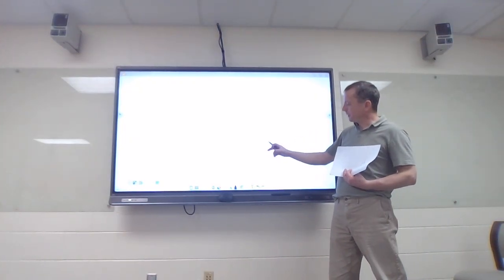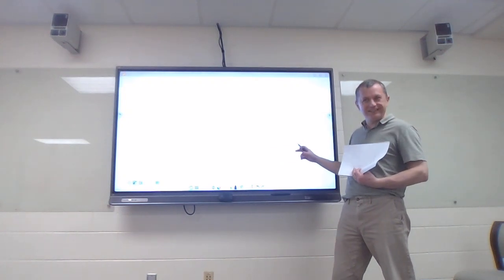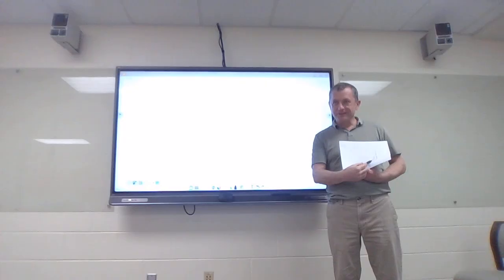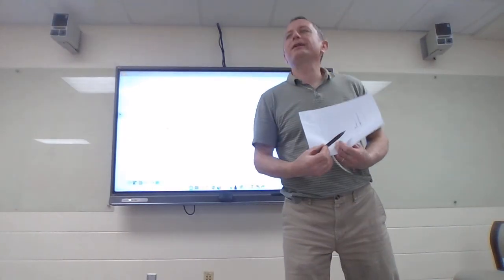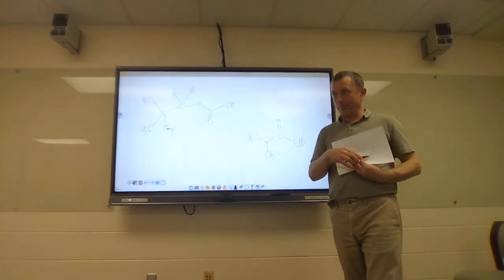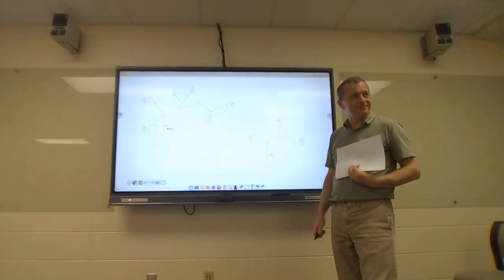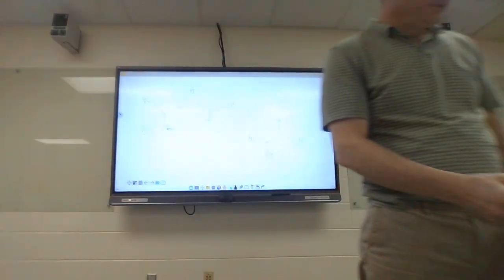So now look what happened to that H. It did separate from that singlet, but now you're seeing all the little peaks there. See that pattern? So anytime I see a doublet with 6 followed by a whole mess, I'm generally looking for that type of a group somewhere in the molecule. All right.